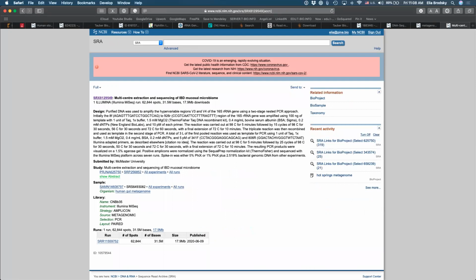Cam actually has here a full description. So she's saying that there are sample metadata and groups, 39 distinct fields, many held data of limited value, sample depth, elevation, latitude, longitude, which means you can actually map them onto a map, material, soil, organism, sample name, feature, high soil, carbon, conductivity, location, average read length, etc.